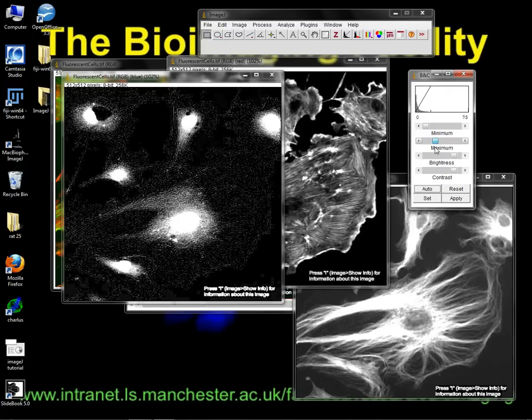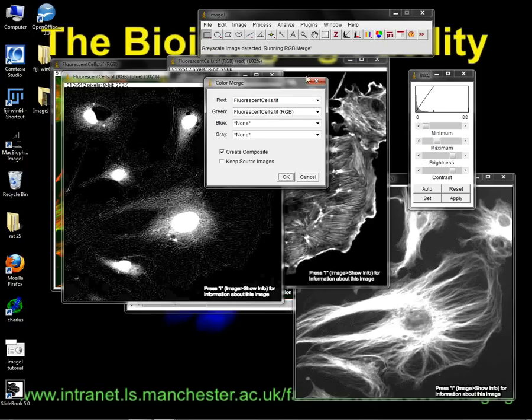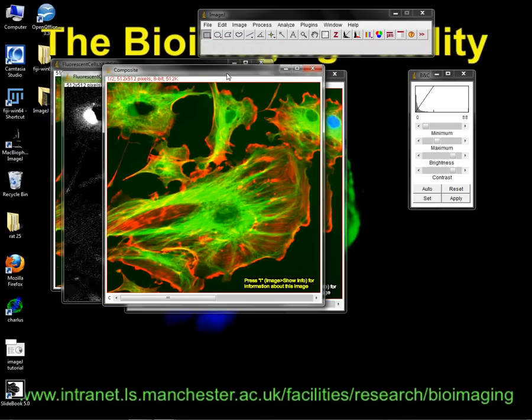You've not got this problem that you're looking at the red, green, and blue simultaneously. And if you want to put those channels back together again, then you can just go in and say, well, my red channel, I want to look red, my green, I want to look green. I don't want a blue one anymore. I don't want a gray one anymore. Okay, and now I've just got my red and green channels. So it's easy to do.